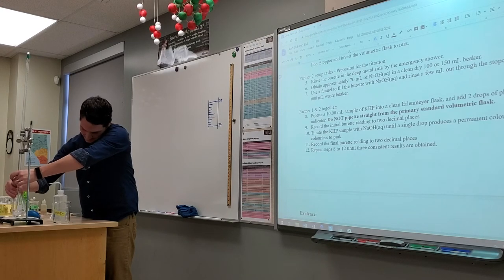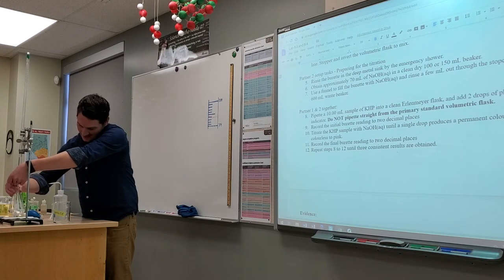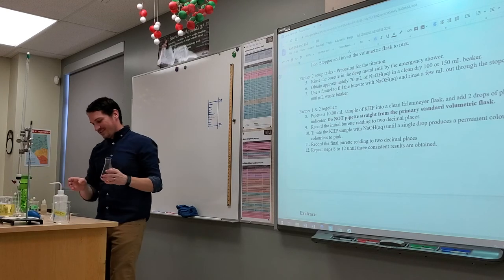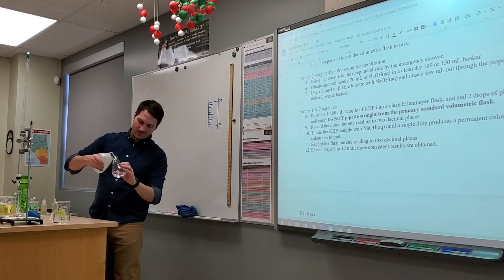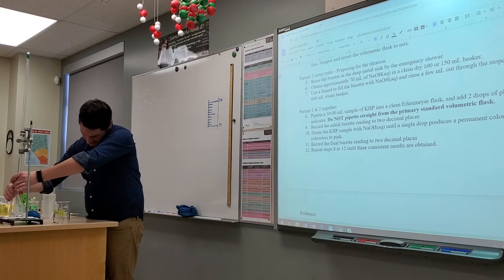You're gonna go drip by drip. And you want to stop when it is the most pale, pale pink you could imagine. I know this is a pain in the butt. I get that. Just dump the whole thing. Oh, man. That's just painful. This is actually what you should be doing. You should be trying to get the tiniest, palest color you could possibly imagine.